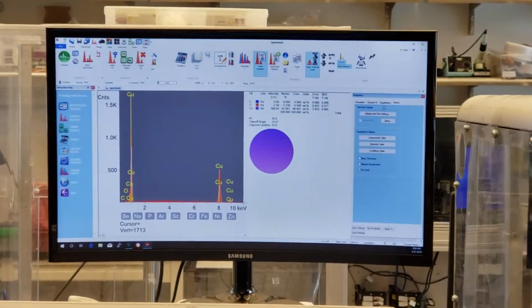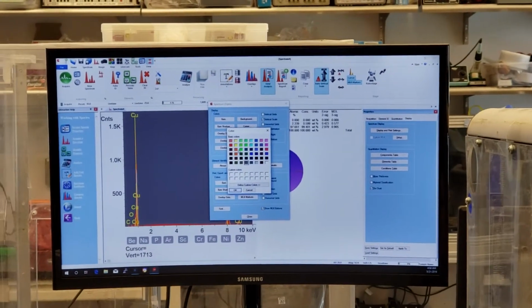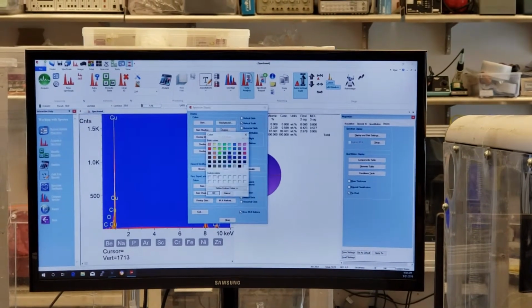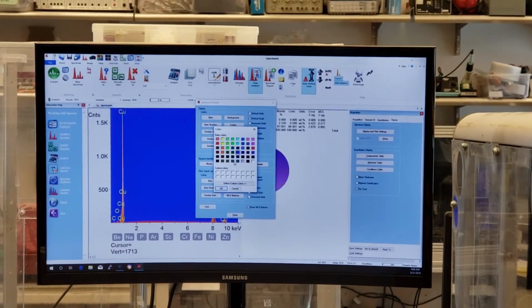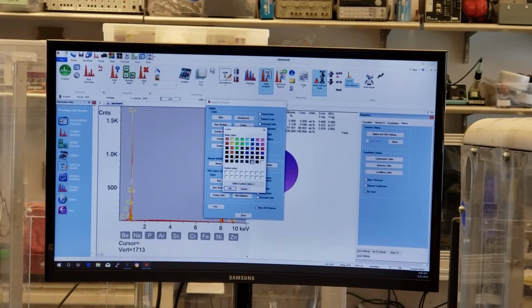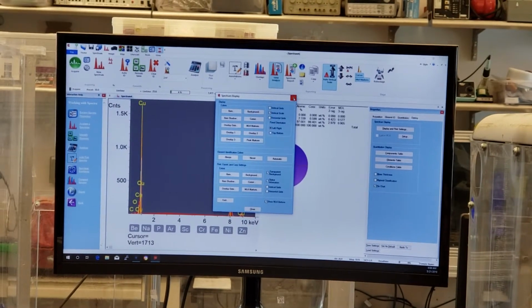That was the display property, and that's where I changed display and print settings. So you can change the background from gray to, I actually had it blue. At any rate, that's just me skipping around. Background back to gray, we'll leave it the way it was. It's too shiny. Yeah, it is. What was the gray? Was it this one? I think it was that one. That's the way it was. That looks kind of nice.